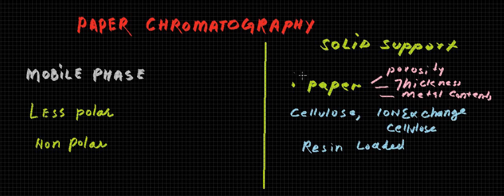These cellulose papers can retain about 5 to 20% of water, based upon the fact that the major portion of this water is held via hydrogen bonding, and the remaining minor portion with other attractive forces.